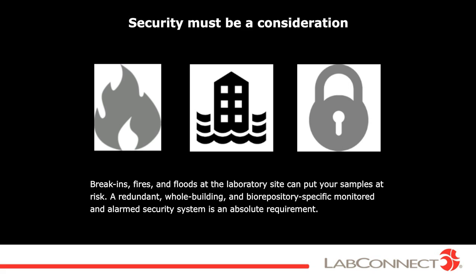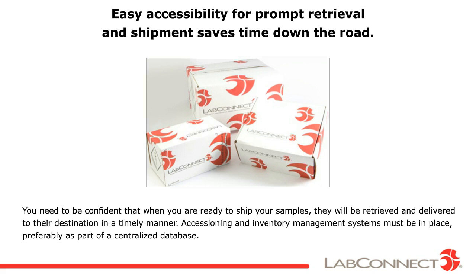Prompt retrieval and shipment of samples is very important. The timing of retrieval and shipment will vary with every trial. Therefore, a clear understanding of accessioning and upfront planning of sample retrieval requirements should be established. Streamlined accessioning and inventory management systems should be solidly in place.